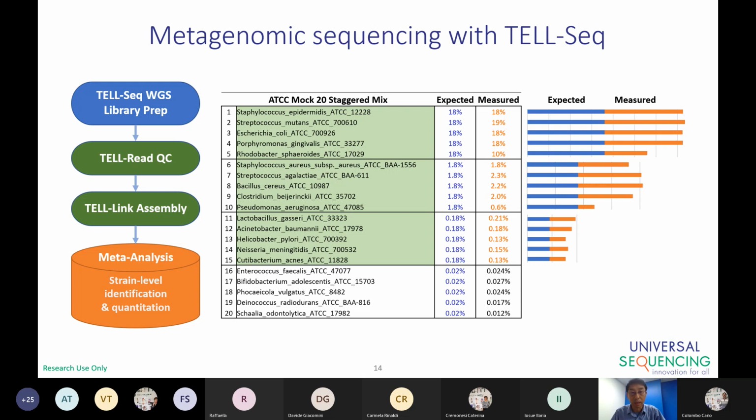However, when we go back to look at the data at the read level, we indeed find that the reads represent those organisms, with the proportions and ratios we expected in those samples. So this tells us the advantage and limitation of this method. Since we do the contig assembly, we get much better information on genes, for example for the metabolic pathways, which is a really good application. But because it's based on assembly, for low abundance organisms you're probably going to have a hard time assembling them properly. It may not be able to detect them effectively.